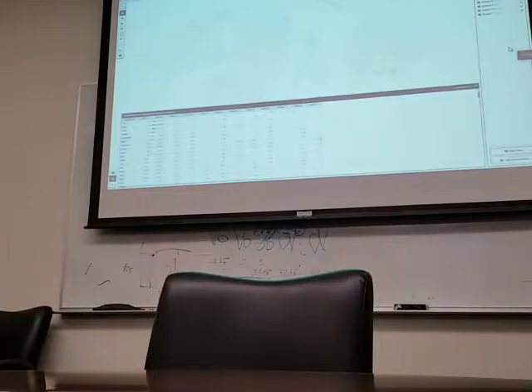Yeah, so that was the 5', 13 clusters, and you can kind of just colorize. Even if you have specific genes in mind, like this TCL1A, if you wanted to colorize based off of that, you can do that as well. So you go to gene expression here, and then just type in TCL1A. I'm not sure what that is, but it shows us the clusters that have high expression of TCL1A.